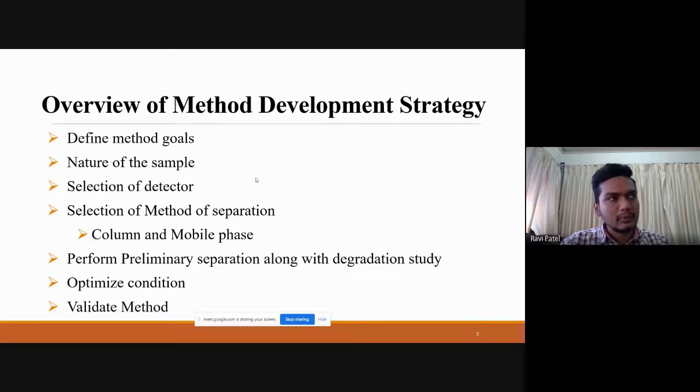In your M.Pharm dissertations, generally students are focusing on developing a method for the estimation of these compounds. Like they are focusing on estimating an assay.